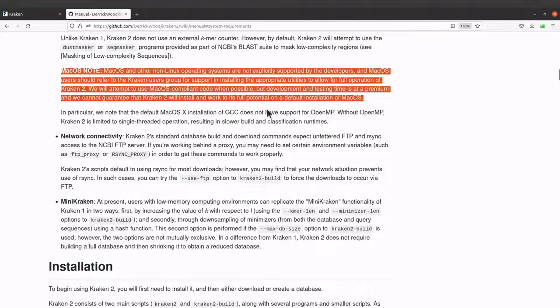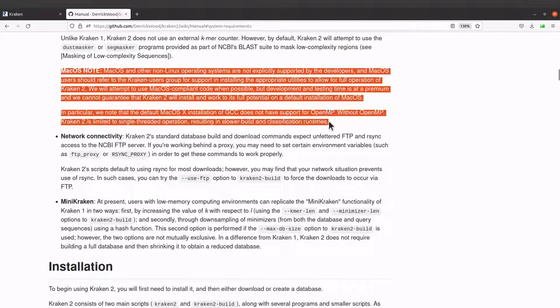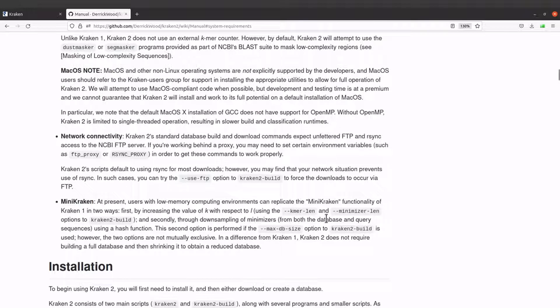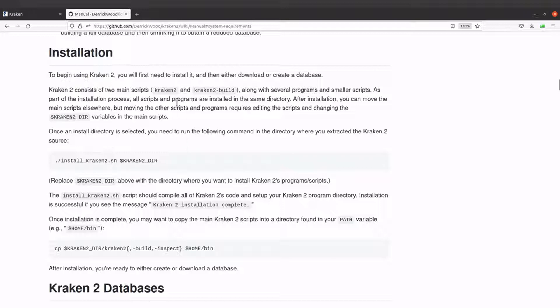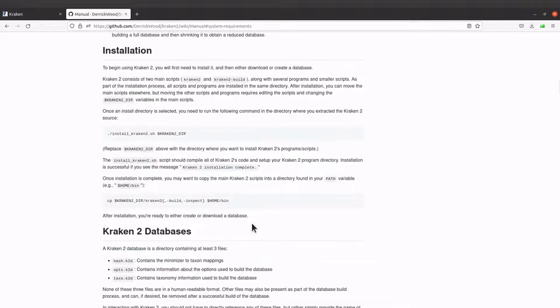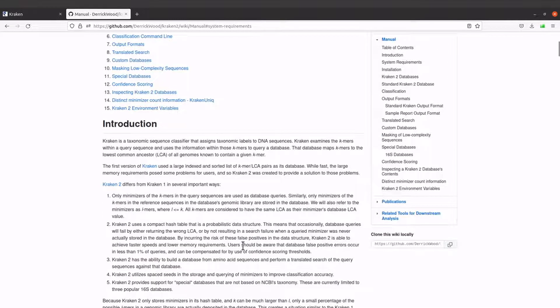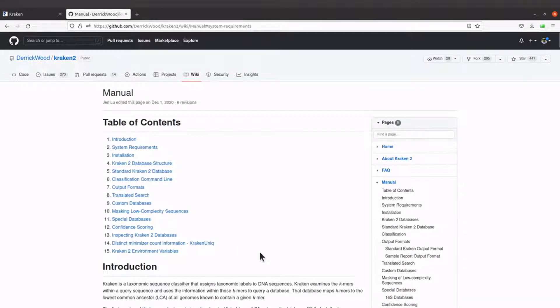I'll skip the non-Linux section because we are focusing on a Linux system. Now let's look at the installation instructions. We will find them here and follow these instructions to set Kraken up on our PC. Let's first get the source code — we will get it from the GitHub repo.